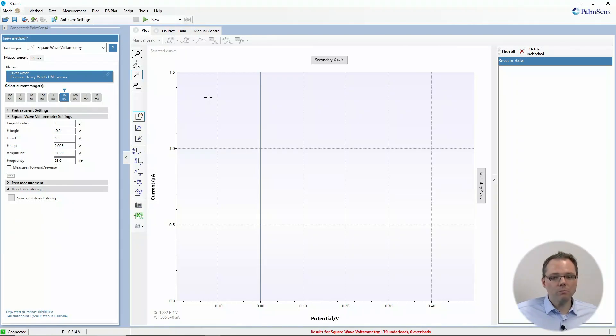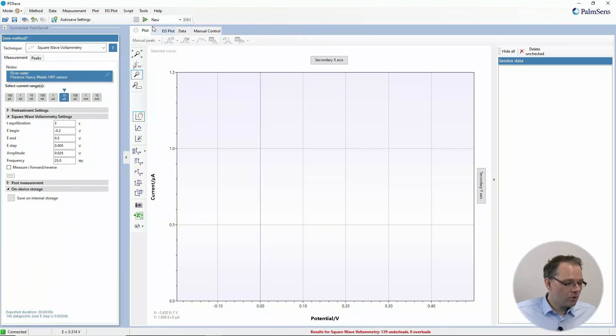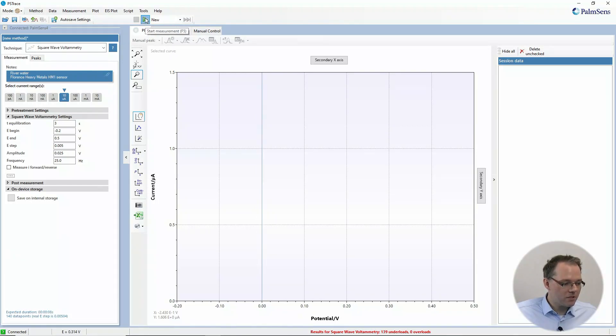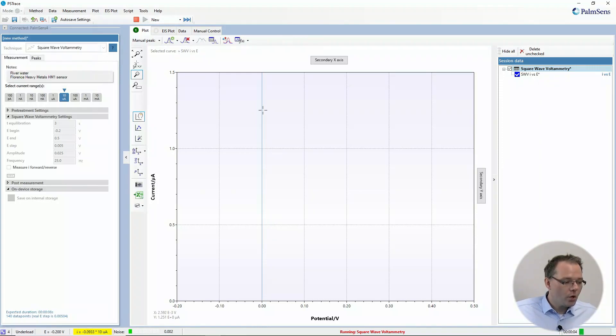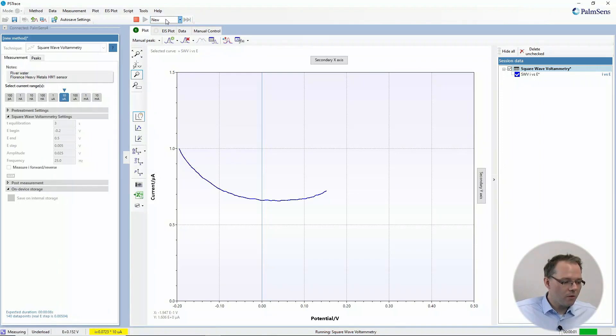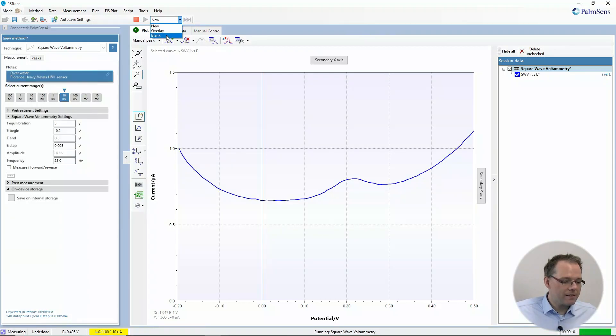You have multiple options, but I will choose to just start a measurement. You could, if you want, select before the measurement to say that this is going to be your blank.